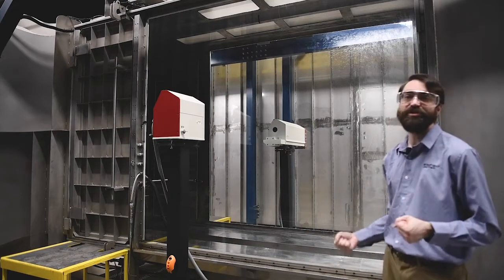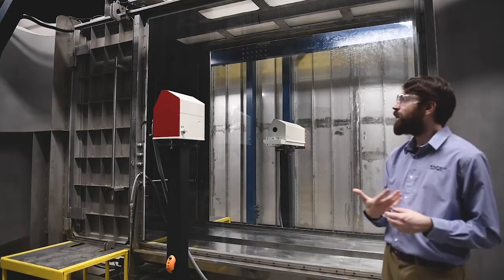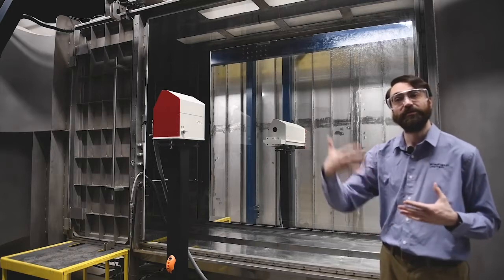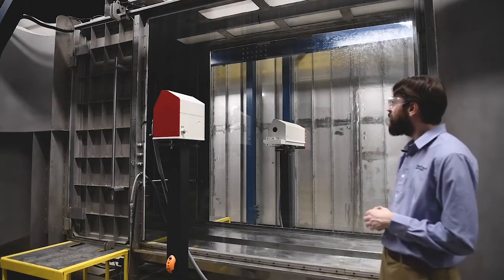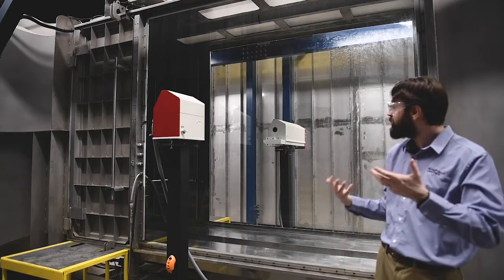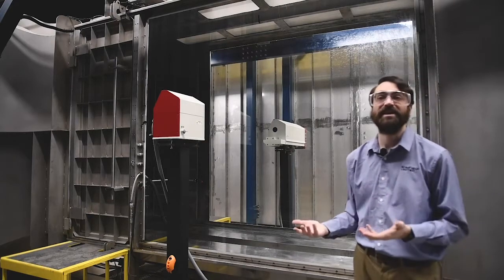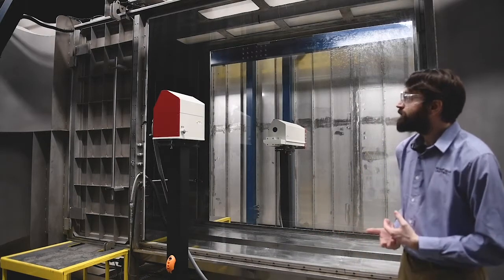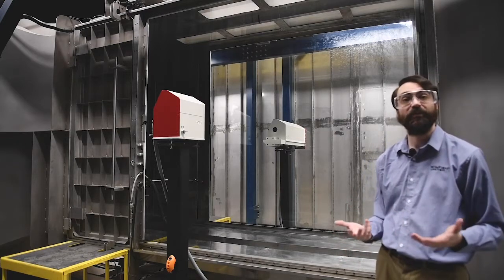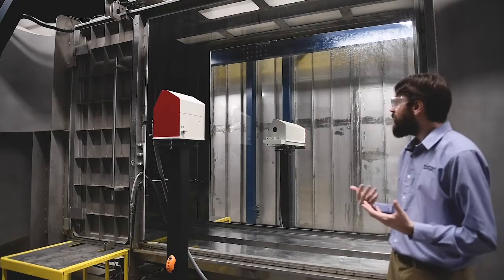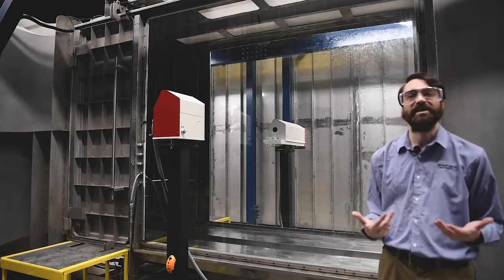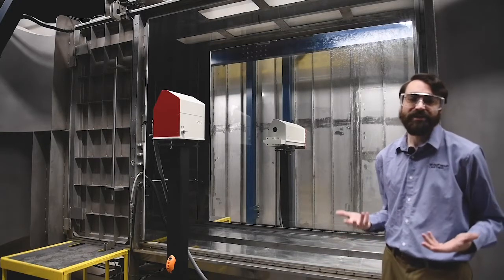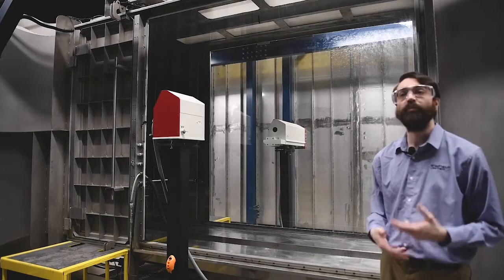The nozzle sprays tank mix parallel to the wind, so horizontally, and the wind is there to keep all of the drops moving at the same speed. The drops then pass through a laser beam produced by a laser diffraction interferometer, which produces the droplet size measurement. This allows us to produce a very repeatable, robust measurement of the drop size produced.